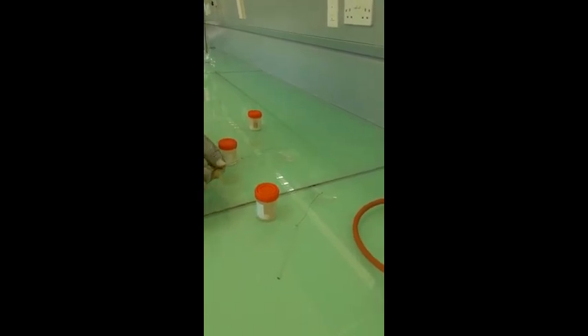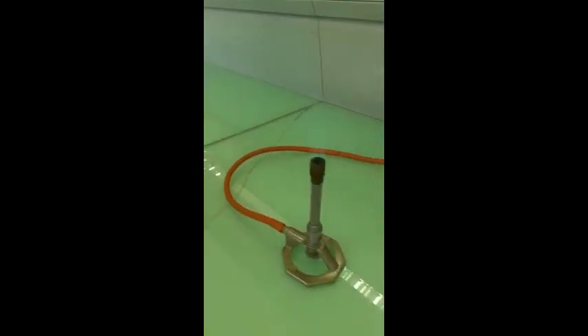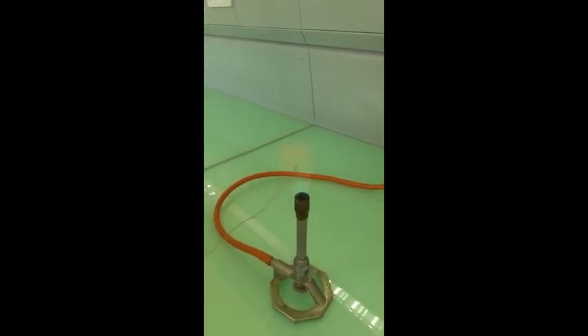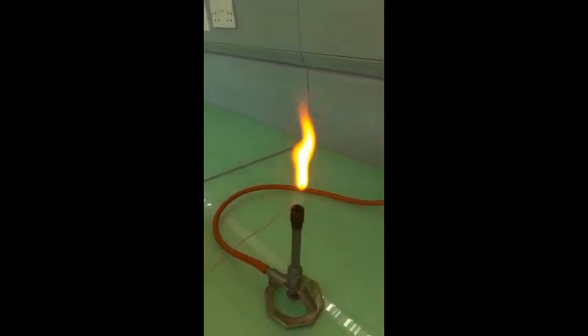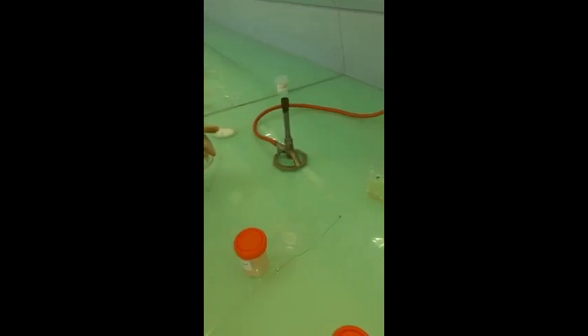We'll do the sodium sample next. The following sample is a compound of calcium.